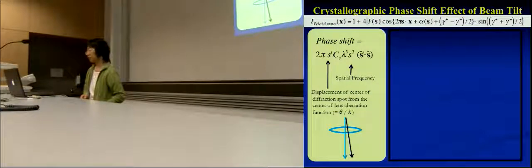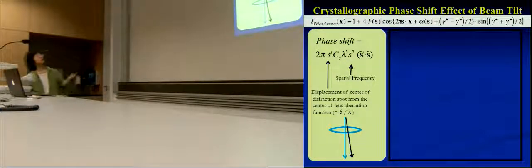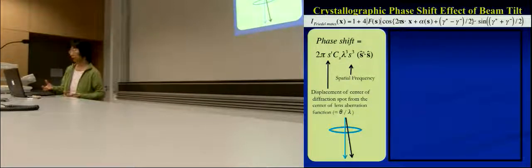The crystallographic one, which, this is the same equation I showed before. This is the CTF part. This is the part I just talked about. This is the crystallographic part. The additional phase shift in the crystallographic phase in here is a harder thing to correct. That basically changes the structure you are looking at. Let's say you don't consider that part, then you have certain beam tilt, then your reconstruction will look distorted. Okay? So it's going to be a problem.